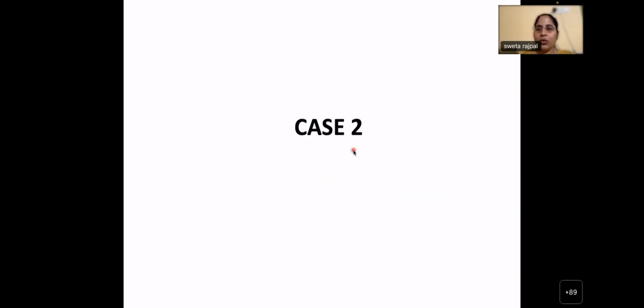Okay. So I'm at the end of case one. Do you people have any questions for me at this time? Yeah, I think there's a very interesting question, Shweta, in the chat box. So the question is that then should NPM1 be done in all cases of MDS and CMML? Because blast count doesn't matter.